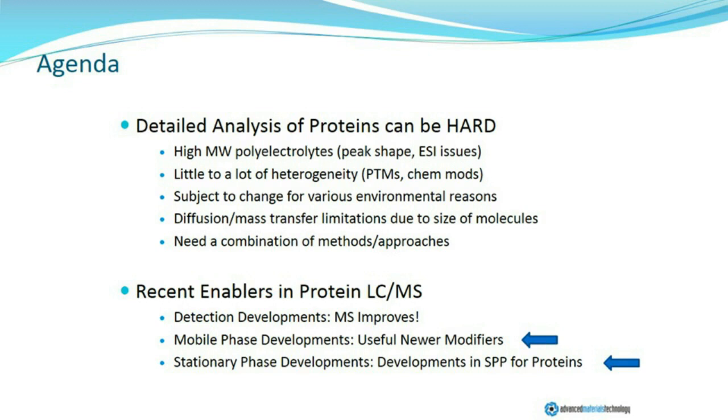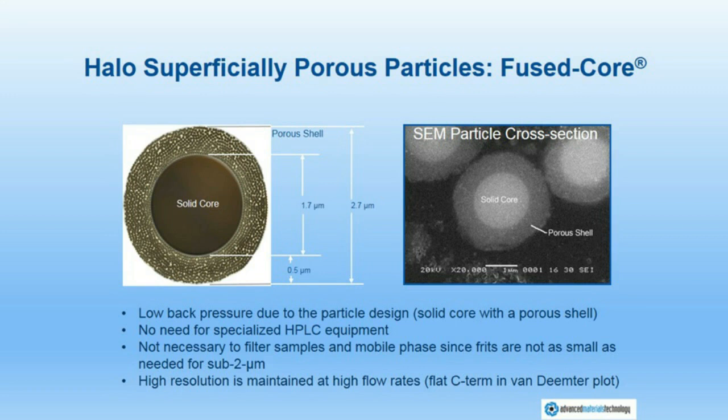There's also been remarkable improvements in stationary phase materials, and this is now winding its way down into protein analytics. Today's discussion will really focus more on superficially porous particles, particularly for protein analyses, but clearly also for fragments, including peptides, as well as larger polypeptide fragments. So, as I mentioned, in today's discussion we'll be focusing really on the use of superficially porous particles.